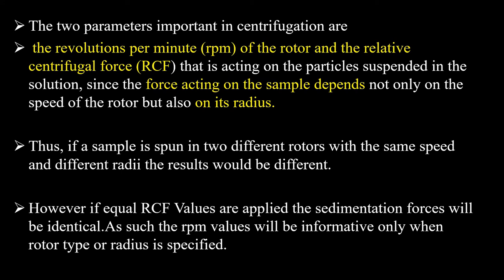Since the force acting on the sample depends not only on the speed of the rotor but also on its radius, if the sample is spun in two different rotors with the same speed but different radii, the results would be different.